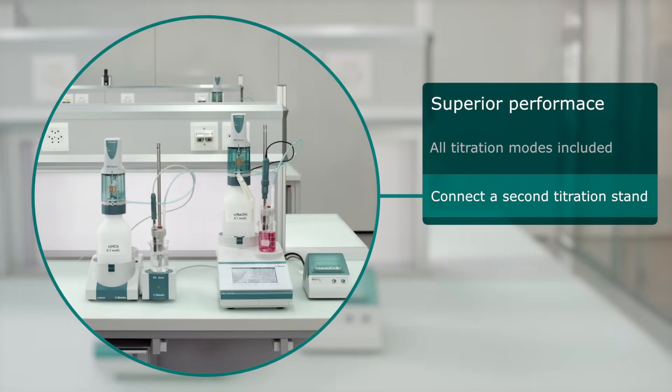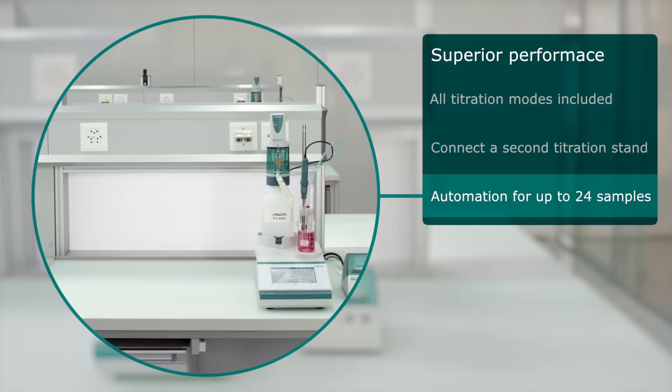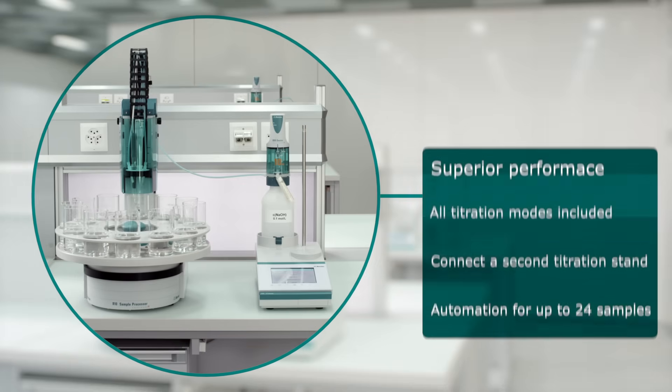Connect a second titration stand for another application any time. To increase throughput, simply connect your 916 T-Touch to the 810 sample processor to analyze up to 24 samples completely unattended.